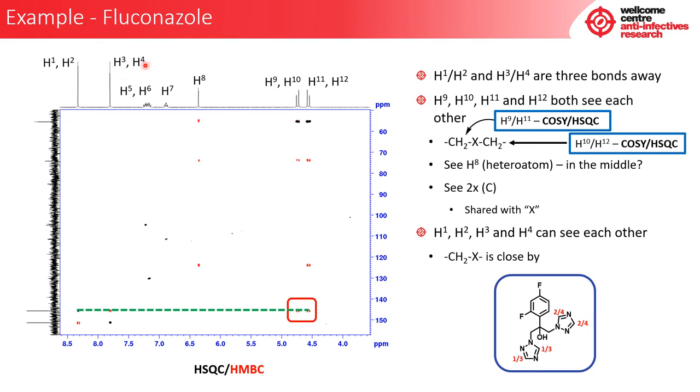We said already that these aromatic peaks contain no neighbours, that they were on their own, and this is represented by this diagram that we can see here, that 1, 3 and 2 and 4, because right now we can't distinguish the differences between these. What I've done is 1 and 3 as one set and 2 and 4 as another, because they are the same carbon but on different rings.